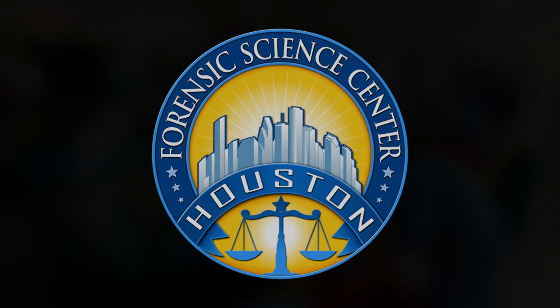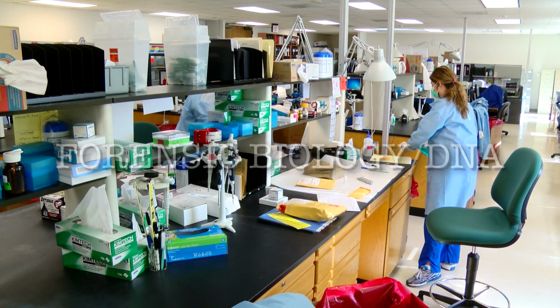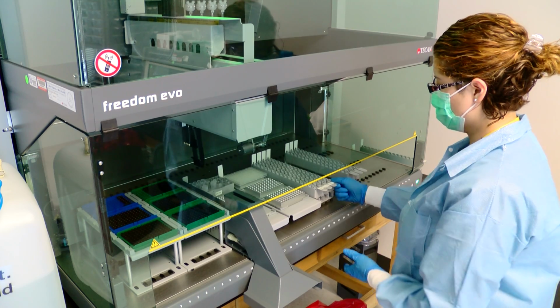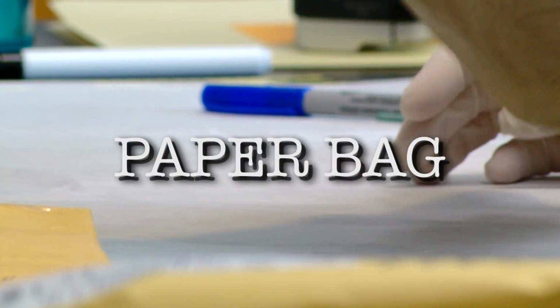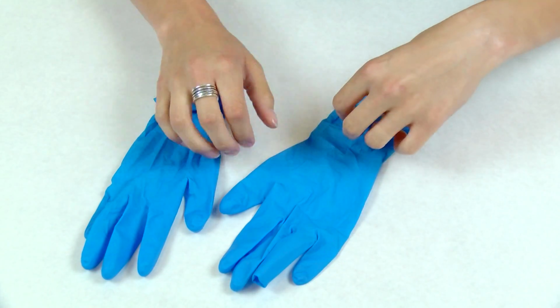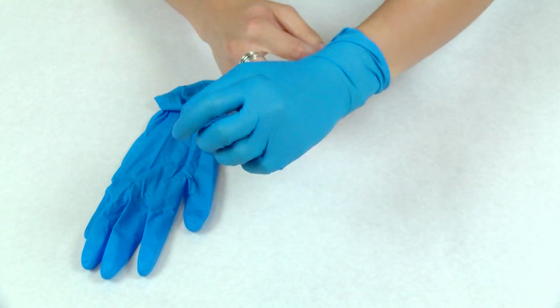The Forensic Biology section provides forensic analysis of biological evidence, including blood and semen. Most evidence collected for DNA analysis comes from burglaries, homicides, and sexual assaults. All evidence should be placed in paper packaging or cardboard boxes to avoid mold growth in the case that the evidence is wet. When handling evidence, it is always best to wear gloves to protect the integrity of the evidence.